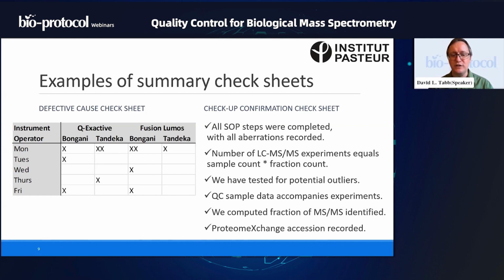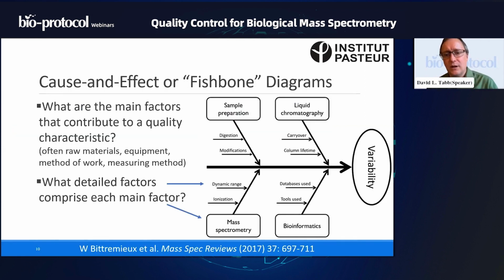Okay, let's move on to the next slide. So a lot of times, the name Kaoru Ishikawa will be associated with fishbone diagrams. They're often called Ishikawa diagrams. These are intended to show causes and effects.